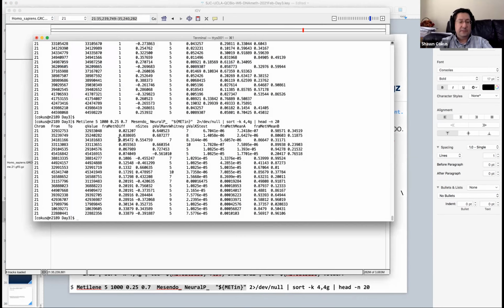Let us put in one of these regions. I actually happen to know, I think it's the second region that I like more right now, so I will show you the second region. This has got a Q value of 0.04. Maybe if 0.05 is what you like to use, that's right on the boundary. We haven't played with these parameters to optimize it, so maybe we make that better or not.